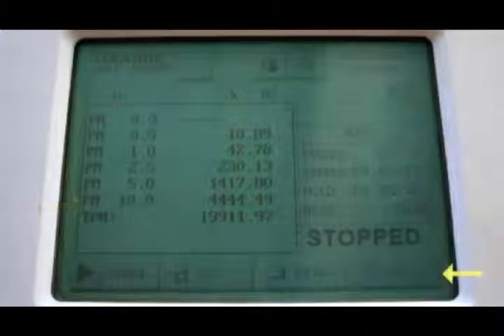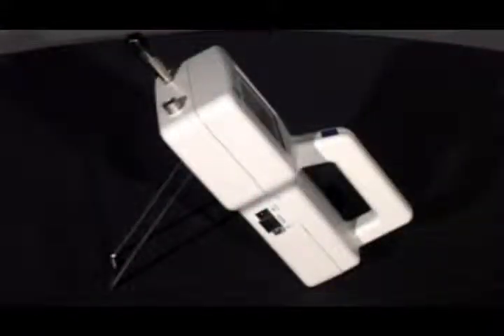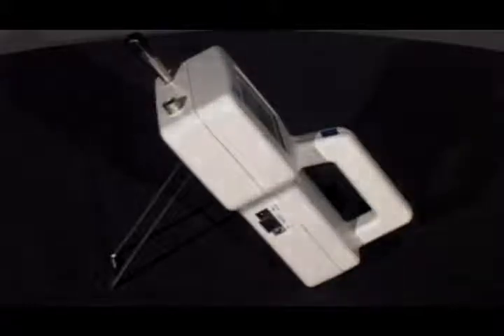There is also a clock button on the CFG screen that allows you to update the date and time. Returning to the main screen, you'll notice a button that says either mass or particle in the bottom right-hand corner. Tapping this switches the instrument between displaying mass, or microgram measurements, and individual particle counts. Set it as you wish. With the data cleared and the program parameters set, you are ready to shut it off and take it to the field.